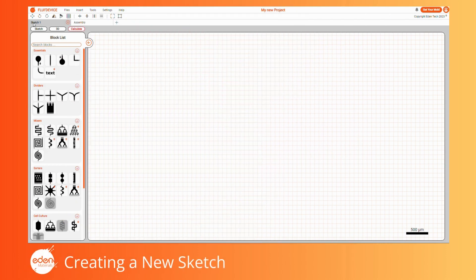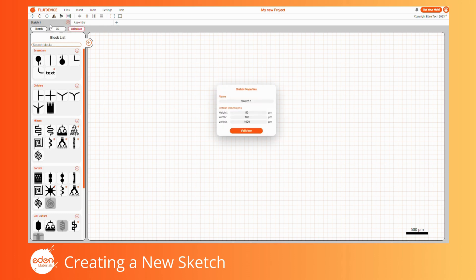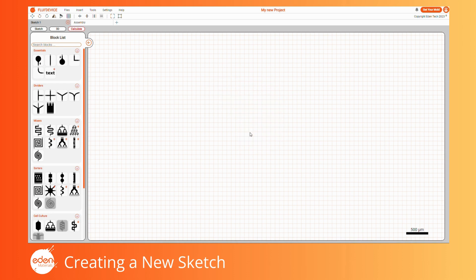When starting a new project, a first sketch will automatically be created, labelled Sketch 1. You can edit this sketch name by either right-clicking on the name or selecting Insert > Edit Current Sketch in the top menu.